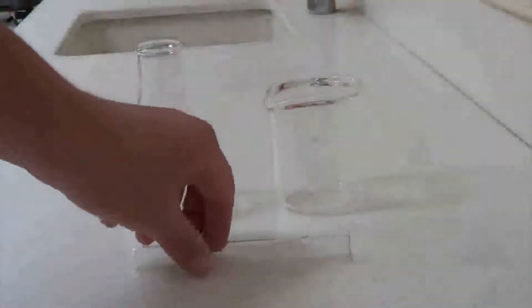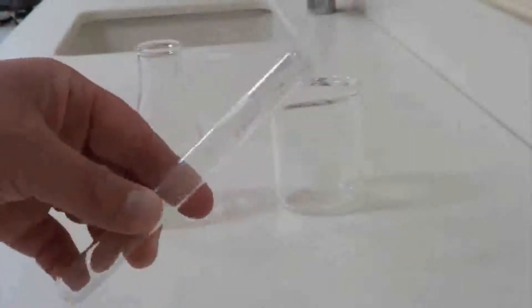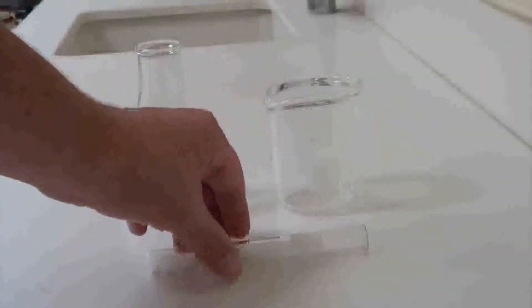Finally, we have a test tube which is used to contain small amounts of something if you need to very clearly see what's going on. More on these later.